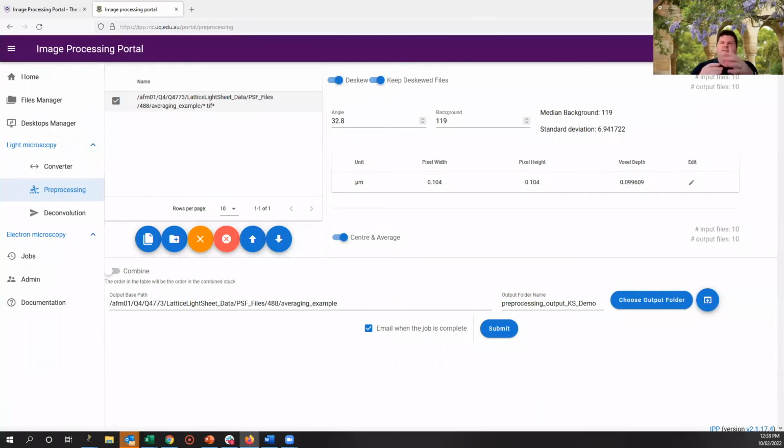Built into the Zeiss system is another affine transformation that lets you go from scrolling through the data set at the side view to a more classical top-down view for the users. It's generating another file layer that's personally not relevant if you can throw that straight into a 3D viewer that you don't need to see single slice info for, whether that's Napari or Fiji or commercial software.